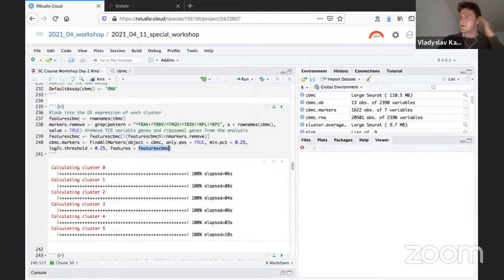Because for example, if you're using something formalin based, like for tissue, it's not really possible to do single cell RNA-seq out of paraffin-embedded FFPE fixed cells. But if you're fixing, for example, in DMSO, like for liquid nitrogen freezing and so on, you can do it easily. It doesn't disturb the RNA quality at all.